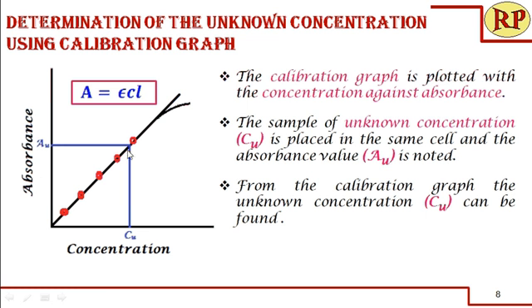We have different concentrations. As the concentration increases, the absorbance is more, because more light is absorbed. Already in the previous session I said, at higher concentration it becomes non-linear, so it is more suitable for lower concentrations.